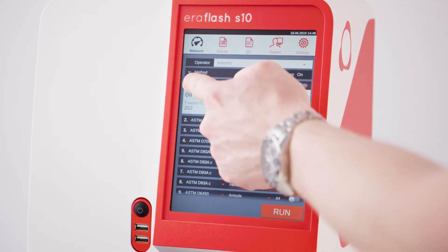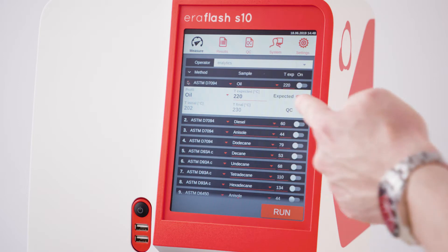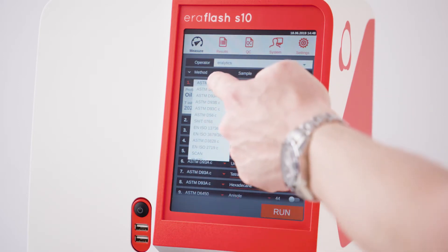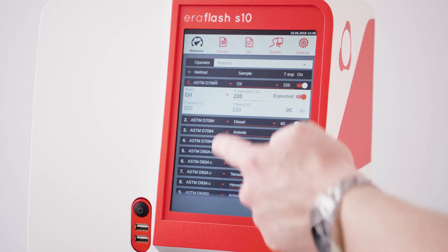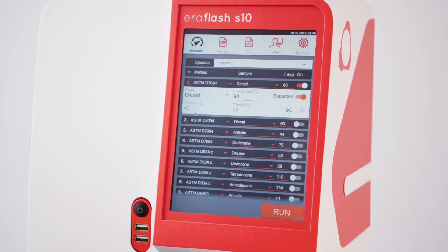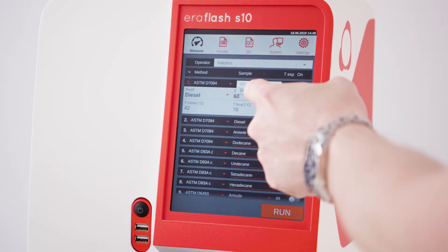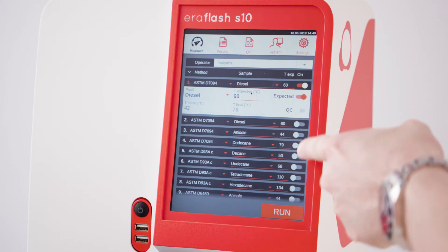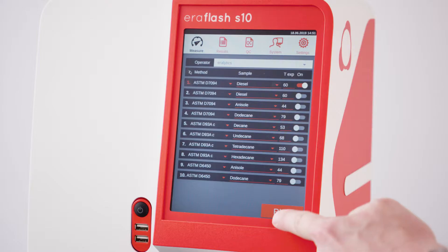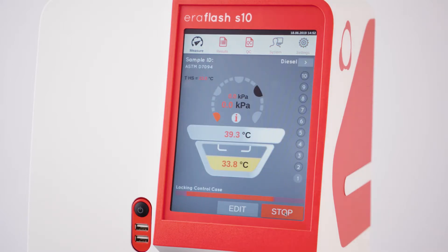Press and hold the number of a desired position to access additional measurement parameters. Select a method from the drop-down list. The measurement profiles allow pre-selection of the sample IDs and a measurement range. The profiles can be programmed in detail in the settings menu. Enter the sample IDs and ensure that the desired positions are activated. Press run to start the fully automated measurement.